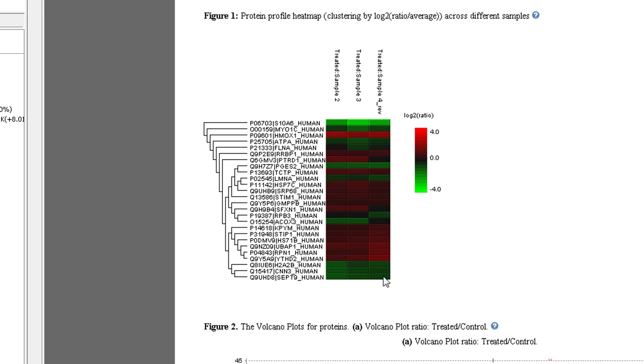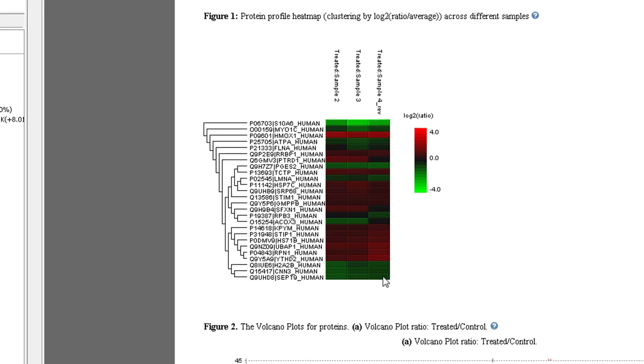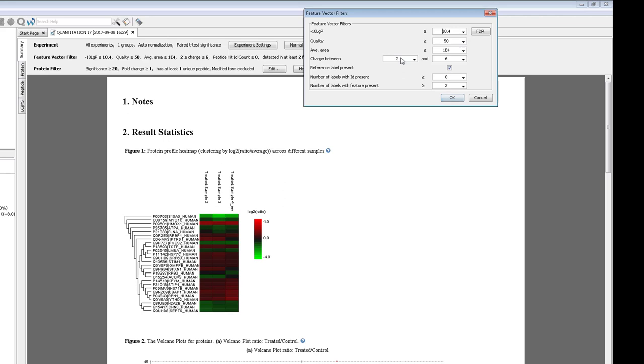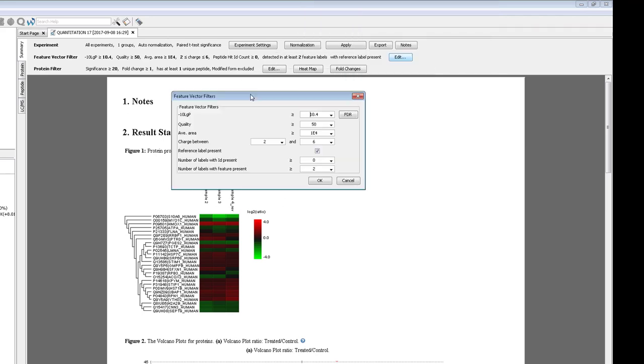But how can we make sure that the proteins that we're reporting have real change between the conditions? We can have some filters that can make sure that your results are accurate. First, check the feature vector filters. Feature vectors are groups of peptide features used for quantification. In this case, it's the combination of the heavy and the light peptide features for one peptide.